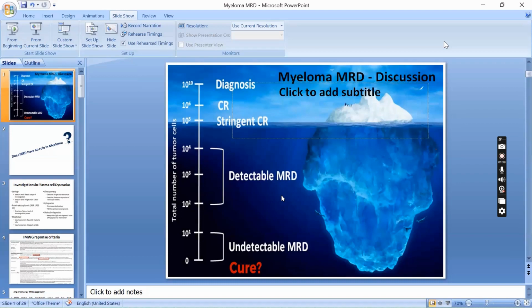See, this is basic. When you want to do lyse, stain, and wash, always use a lyse without fixative. I'm not saying Versalyse. Versalyse is a special type of non-fixative lyse which uses saponin for lysing, I suppose. The best is ammonium chloride.